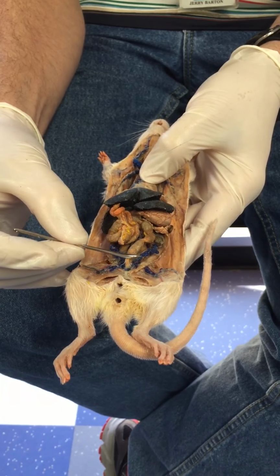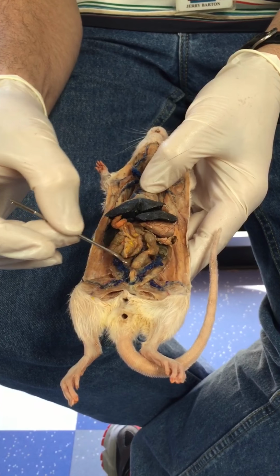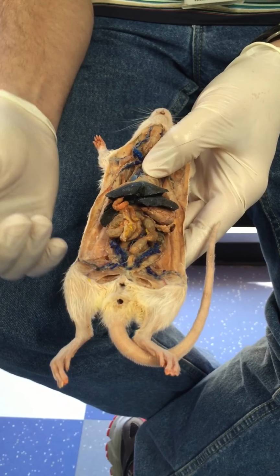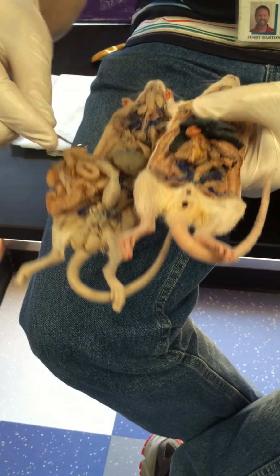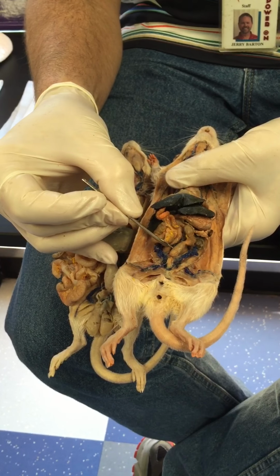So in the male, behind the bladder, you're not going to see this Y structure, which is the uterine horns. So the males don't have uterine horns. When you look at the male, notice behind the bladder you just have the rectum, whereas here you have the uterus with the Y and then the rectum.